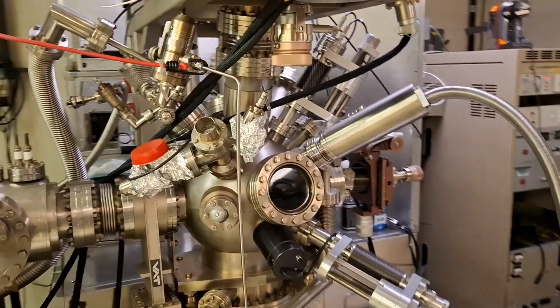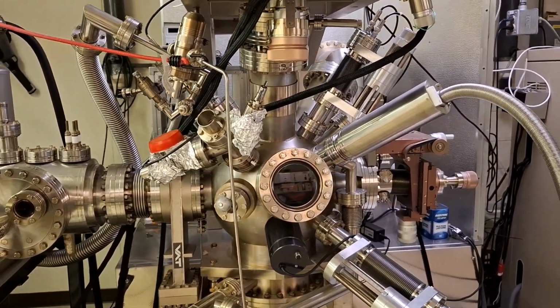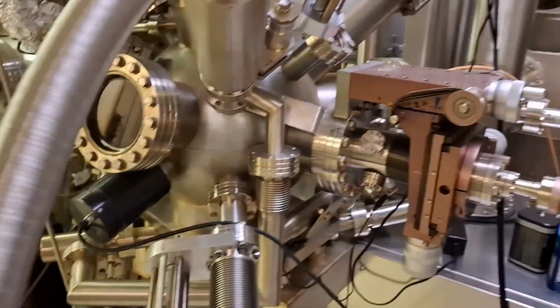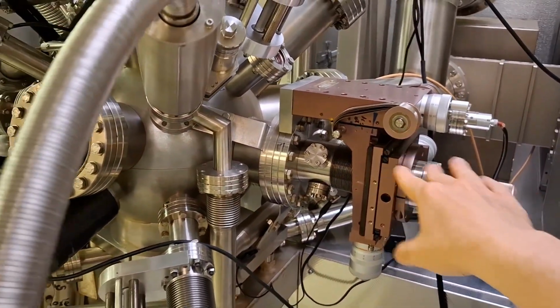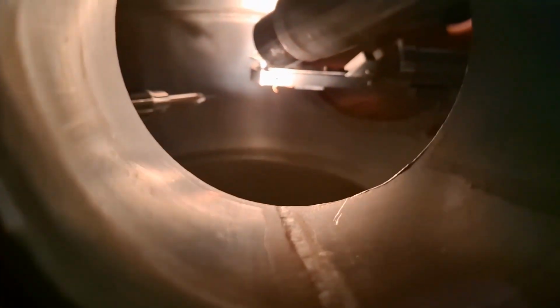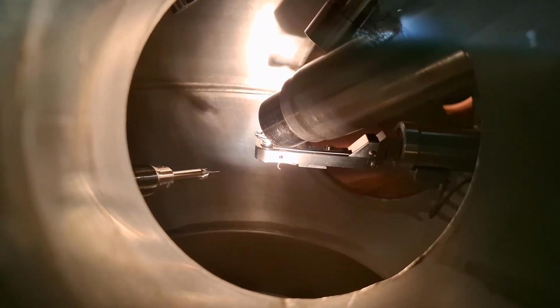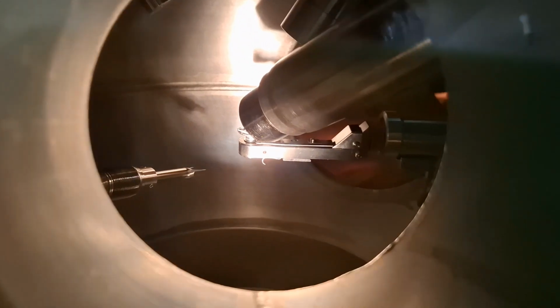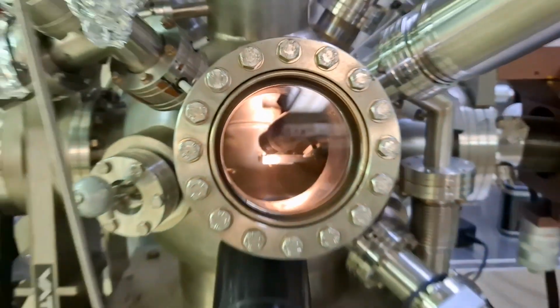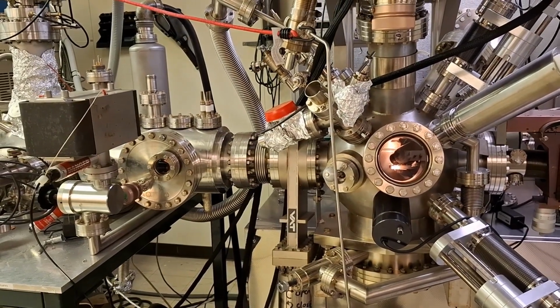By the way, we can also perform angle-resolved X-ray photoelectron spectroscopy, since we can tilt the sample by using these knobs. I can also move the sample inside the chamber, so actually you can see a sample there, and I can put the sample by using this arm. So it's a beautiful system, and I think that's all.